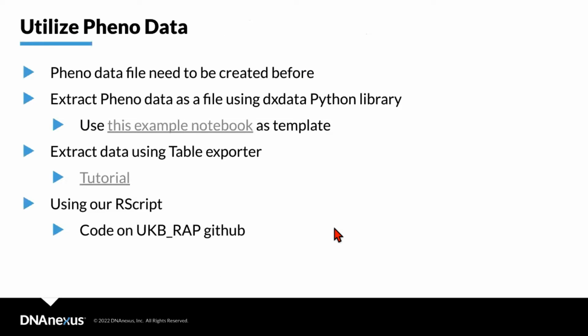So this was just a few snippets of code for the bulk files. Now we can look more into Pheno data, phenotypic data, and how you can work with them on RStudio.